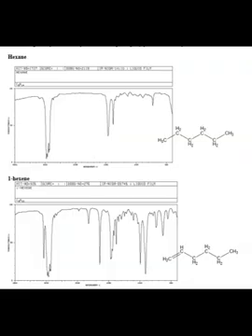But let's take a look at two different versions of a spectrum now, because if you'll notice here, this is hexane, single bonded, and then this guy is hexene, right?